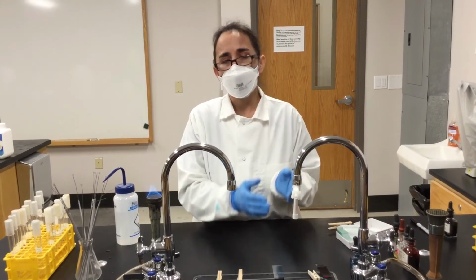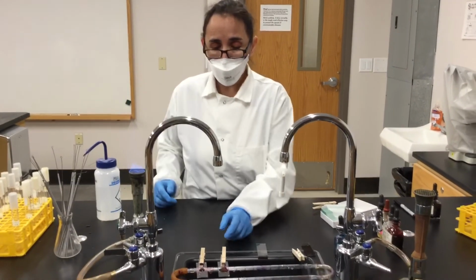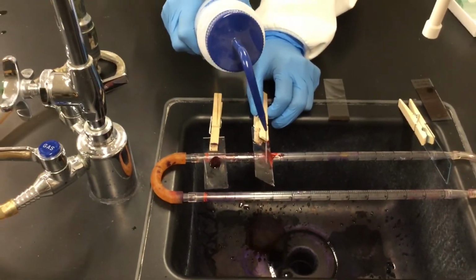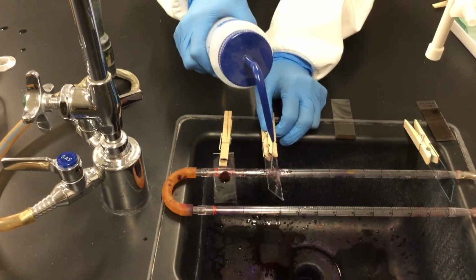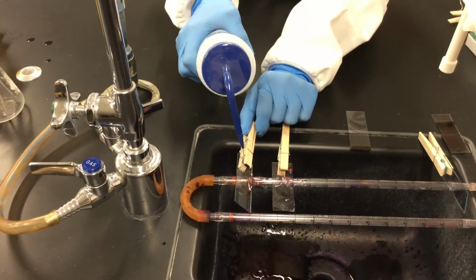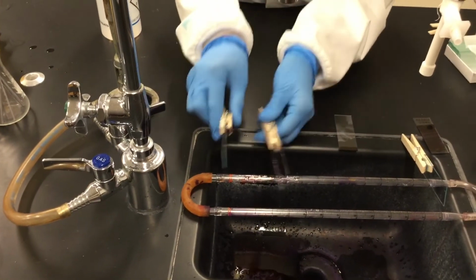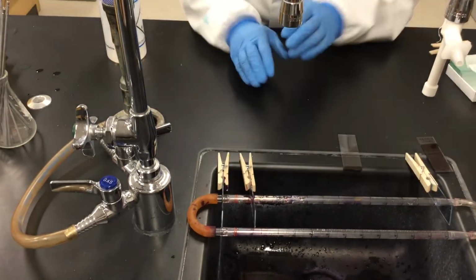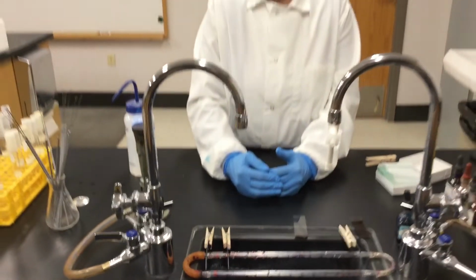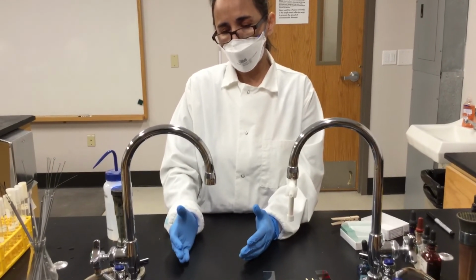So that's why you need to add your secondary staining. So now I'm going to rinse, and then I'm going to keep explaining. So again, you just angle a little bit your slide, and then make sure that you don't have any safranin. And then you just shake off the excess of water and let it be vertical like that until they dry. And then when you add your counterstain, your gram-negative bacteria will stain with safranin, which is red.